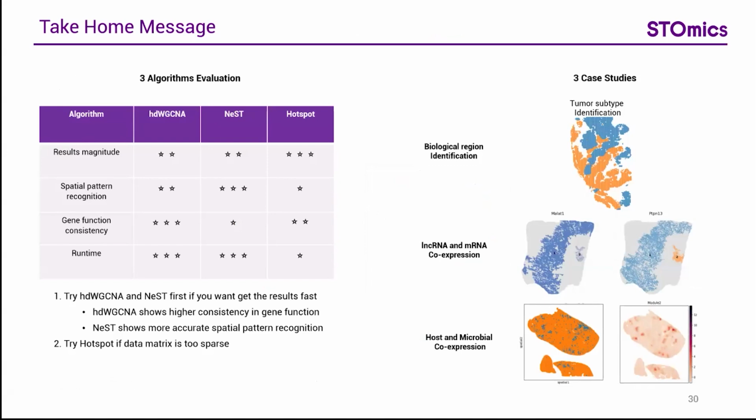Finally, we summarize today's presentation. We have detailed why we study spatial gene co-expression and its specific application scenarios. In the performance evaluation, we tested 3 algorithms on Stereo-seq data. These algorithms can utilize spatial information and adapt to high-resolution data. The test results show that each algorithm has its strengths and weaknesses. We recommend selecting the appropriate algorithm based on specific samples and making personalized parameter adjustments.